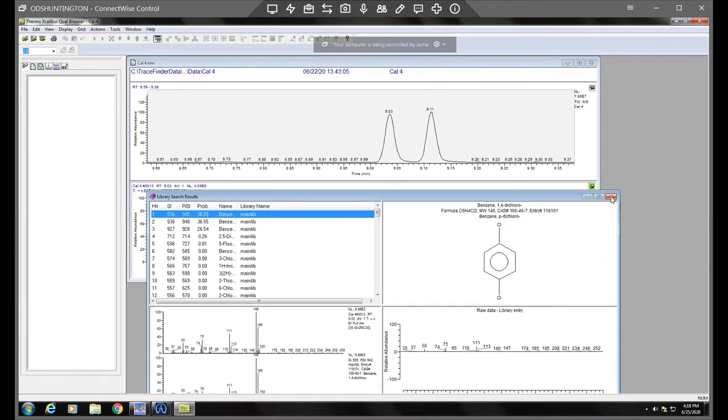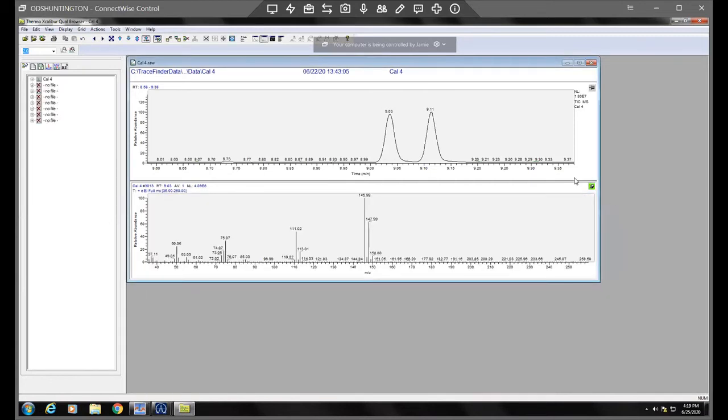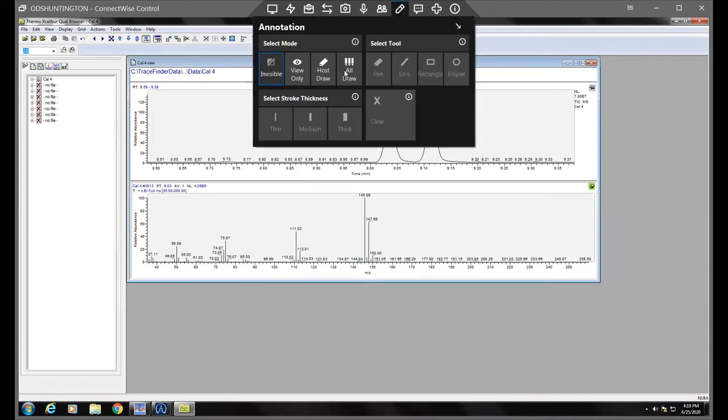The other video had shown how you go into the master method and update those. So I just wanted to show you how you would verify the actual identification of those compounds. I'm going to show one other example.